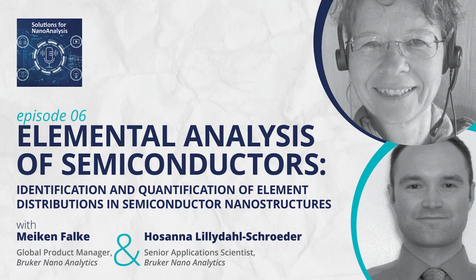And it's very complicated. And then sitting on top of this complex background is the EELS edge. And then there are particular elements which overlap or have so-called delayed edges, long range, broad edges, like 3-5 semiconductors, the heavier elements used in 3-5 semiconductors. And this is quite uncomfortable to use for element ID and quantification.